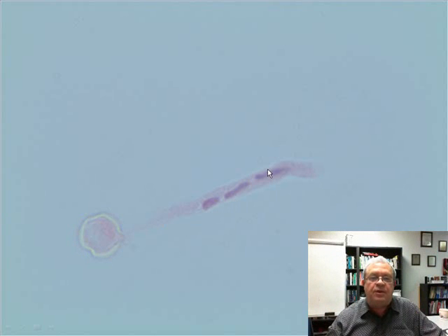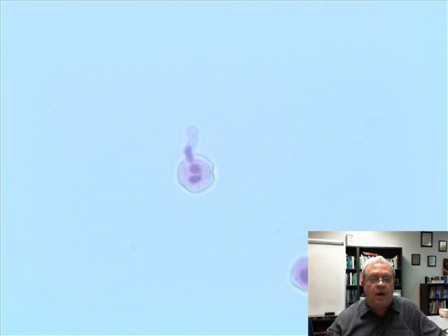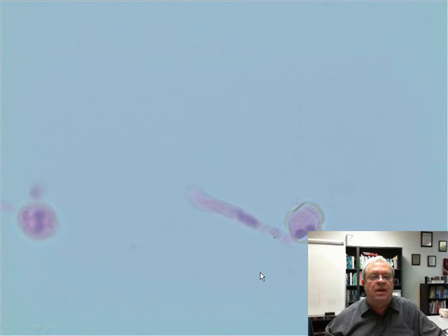How many objects are inside the pollen tube? One, two, three. Where'd they come from? Well, probably out of the pollen grain, but let's check it out. Let's see. Wow, what do we see here? We see a little pollen grain just starting to grow its tube, and I see two objects inside the pollen grain and one just starting to leave the pollen grain and going into the pollen tube. Here I think we see about the same thing down here, although it's not real clear.